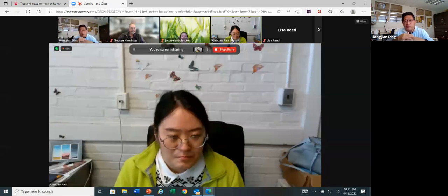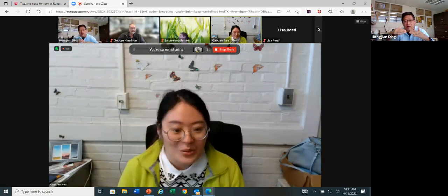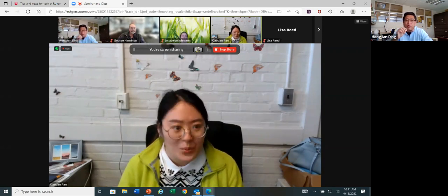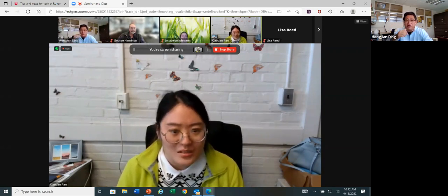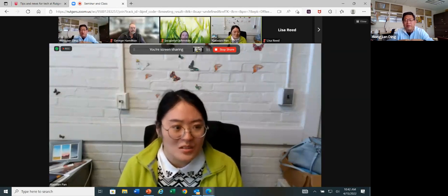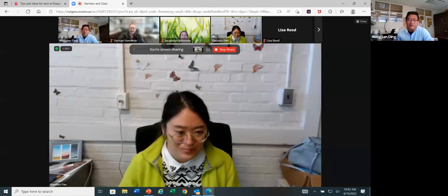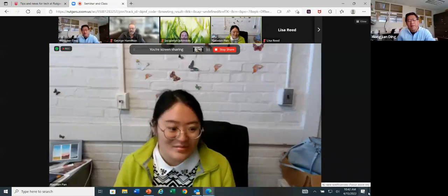On the larva the chitin mark is much stronger, and even the inside organs, except for the middle gut and other parts, you can see pretty clearly. After the aspiration tube, you can see that everything is there. I'm working on fly larvae, and it's working pretty good. Thank you so much. My pleasure.